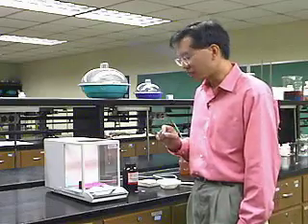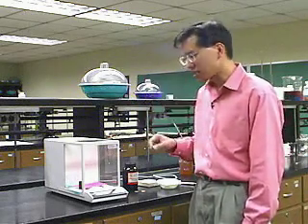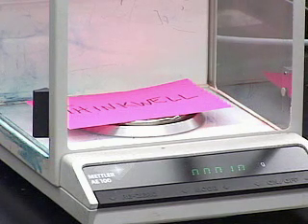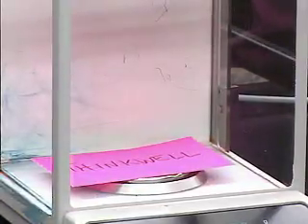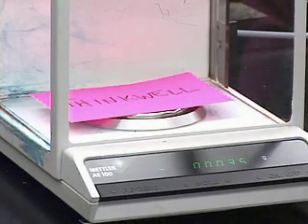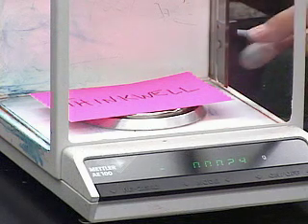Because it weighs to such high precision, even air drafts in the laboratory can affect how well it works. To illustrate that, let me open the doors. The balance is settled down at around one milligram, but if we open the doors, the air currents in the laboratory cause the reading to wander around all over the place. You can see the numbers are just running amok — that's mostly because of air currents blowing through the lab.